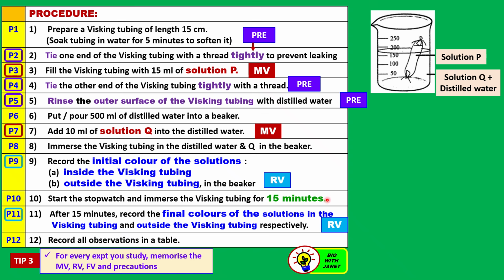If you check through the question later on, you'll find that they do mention 15 minutes. So it pays to just flick through the paper and you may get some hints there. All right. So why don't you put it for 10 minutes? Because if shorter than 15 minutes, it may not show the result yet.